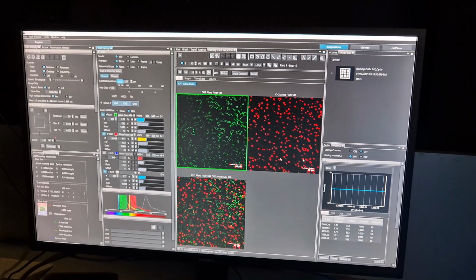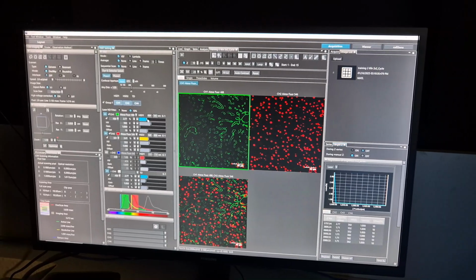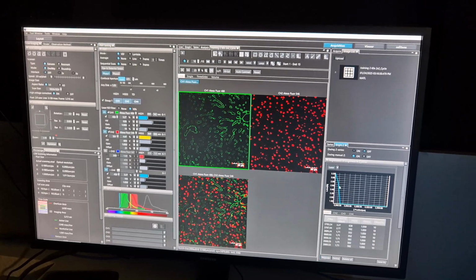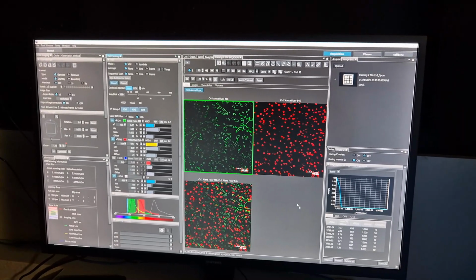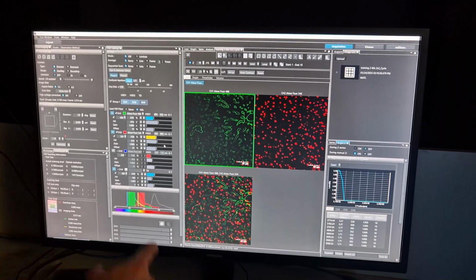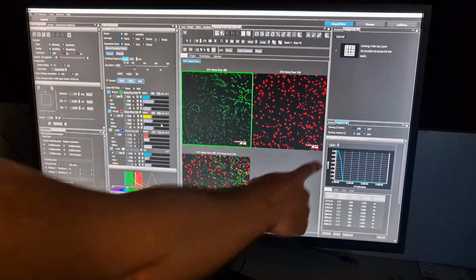We say register, and now see it's changed. I'm going to go deeper again through Z, register these increased values, and register. You see we're starting to create a curve for the actual position. And you see here, I'm moving the Z, and look, these levels are changing now because it's following this path.